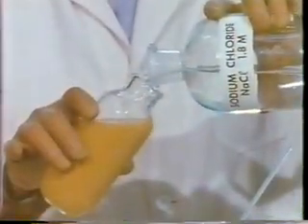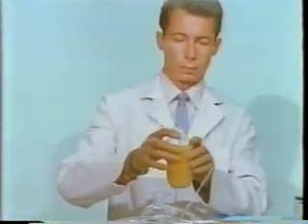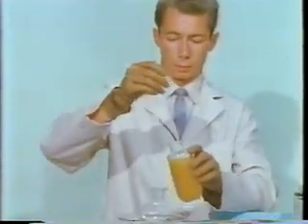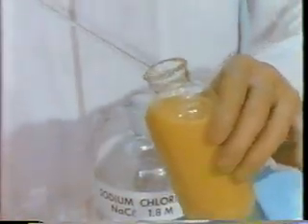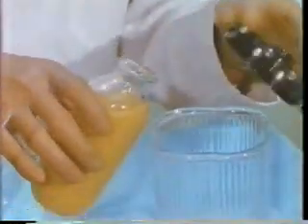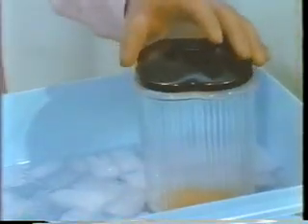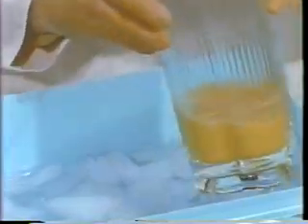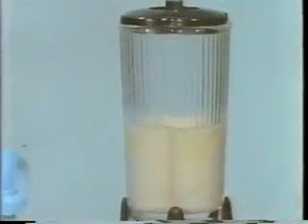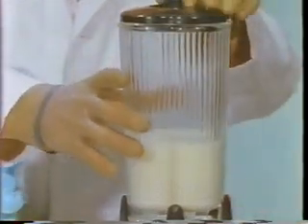The cells are then resuspended in cold sodium chloride solution to dissolve the DNA. The low temperature retards enzyme action. This cell suspension is placed in a blender. The violent action of the blender fragments the cells to facilitate dissolving DNA.